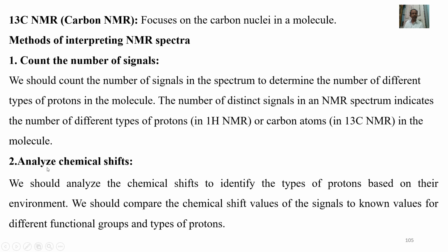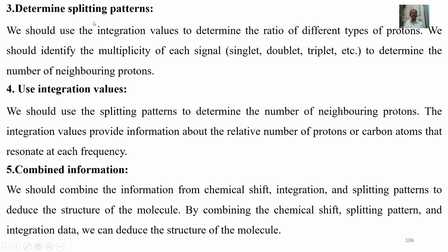Second one, analyzing chemical shifts. We should analyze the chemical shifts to identify the types of protons based on their environment. We should compare the chemical shift values of the signals to known values for different functional groups and types of protons. Third one, determining splitting patterns.